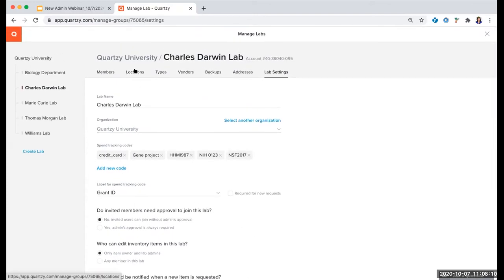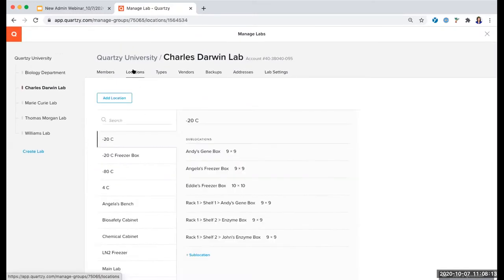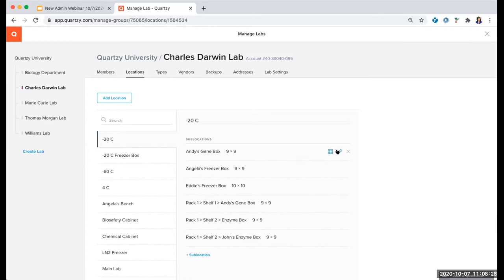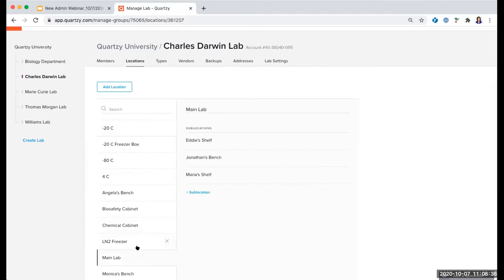Going back up to the top, we'll look at the other tabs here. We've got Locations, where you can set up where items are located. For example, you can see the minus 20 Celsius freezer here as well as sub-locations. I can click on the box or the pencil icon to edit the items found in these sub-locations. In another location you might have different types of sub-locations that are more like benches or shelves, and clicking the pencil icon is also the way to edit these.